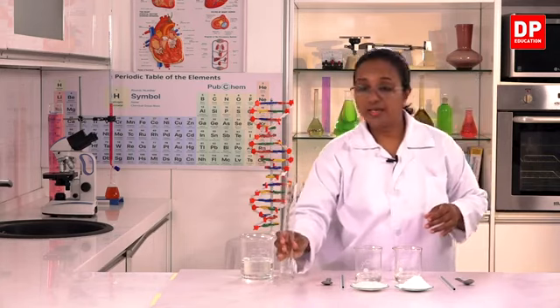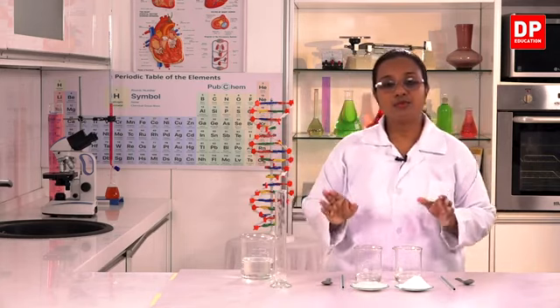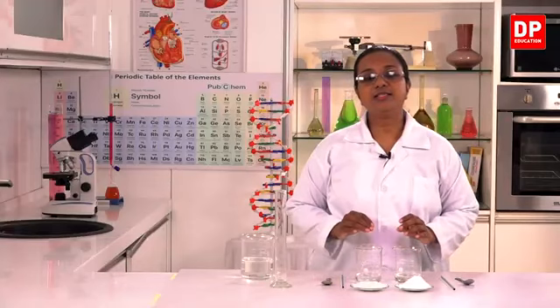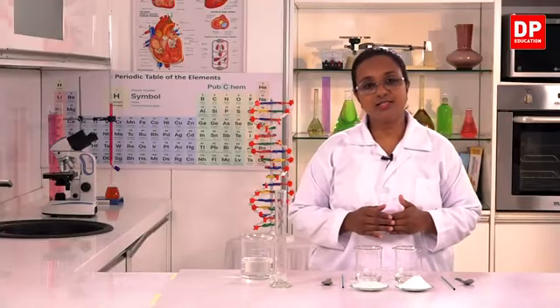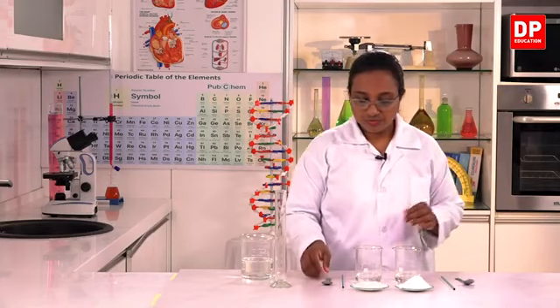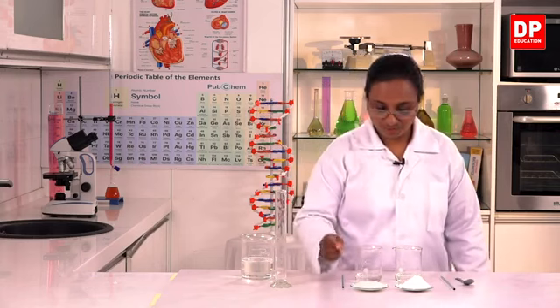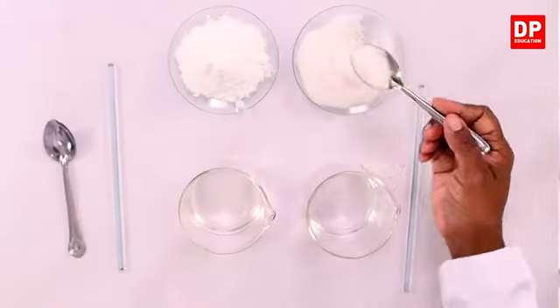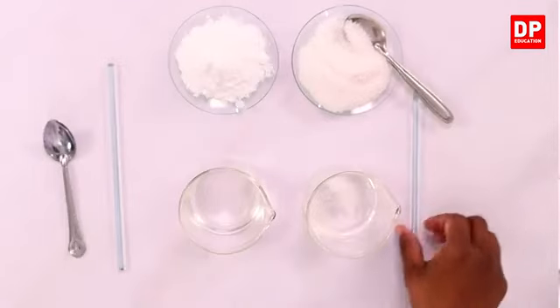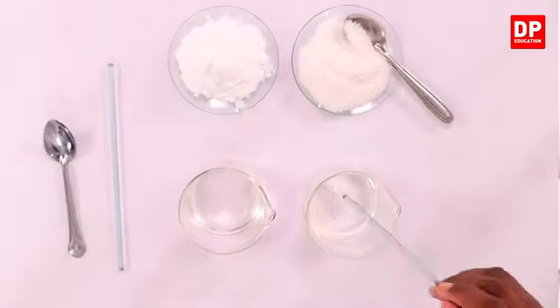So now we have equal volumes of water at the same temperature. So solvent is the same, the temperature is the same. Only difference is the two solutes. So first I will dissolve sugar. So if I start dissolving sugar, we have to start with 1 teaspoon.